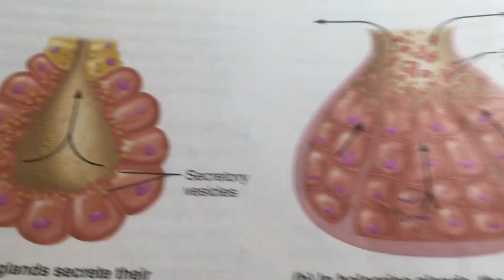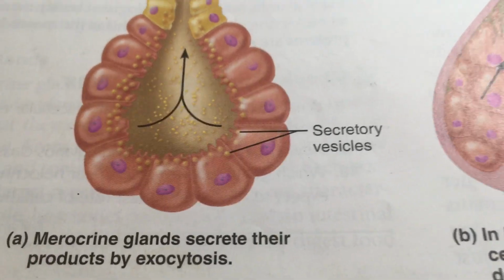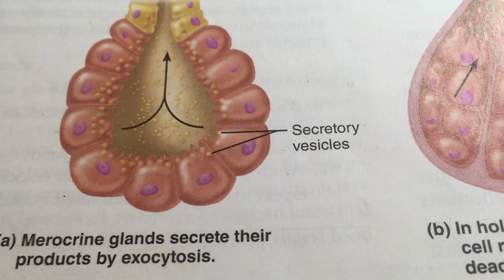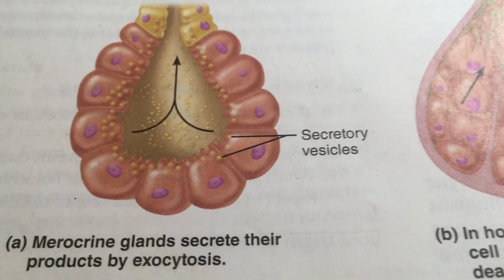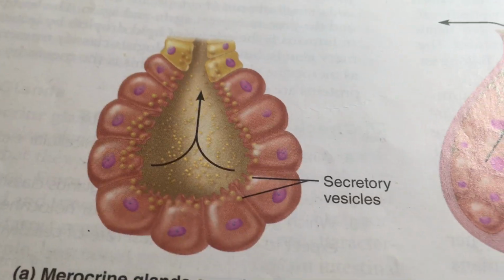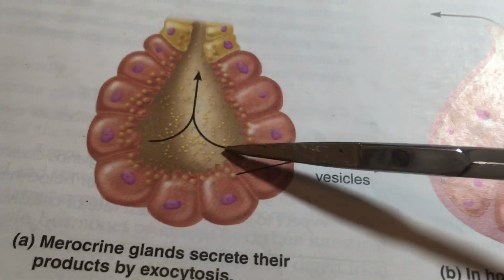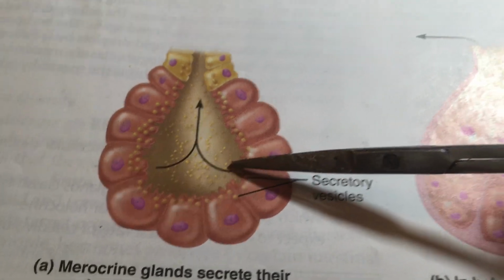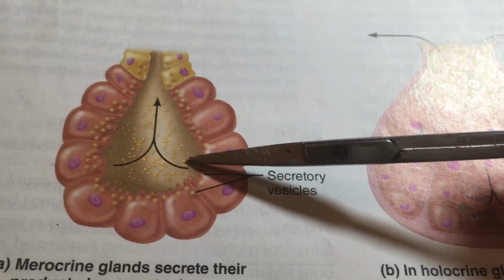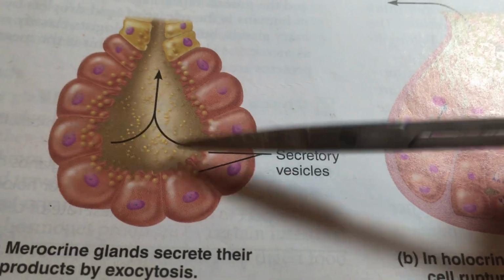a particular direction. Okay, so here is something that's referred to as merocrine gland tissue. That is to say, it's secreting based on little vesicles that are releasing the product that's being made by each of these cells. The product is entering here. This could be enzymes, for instance, in the pancreas, pancreatic enzymes that are useful in metabolizing food in the small intestine.